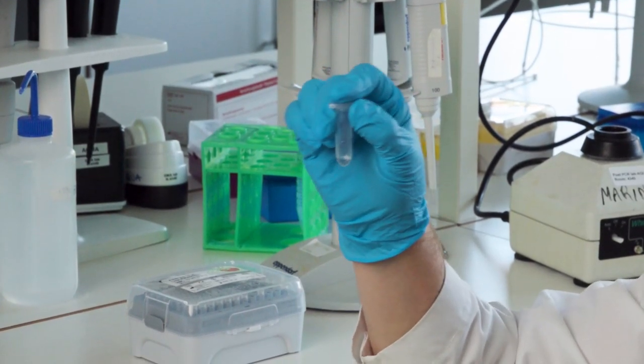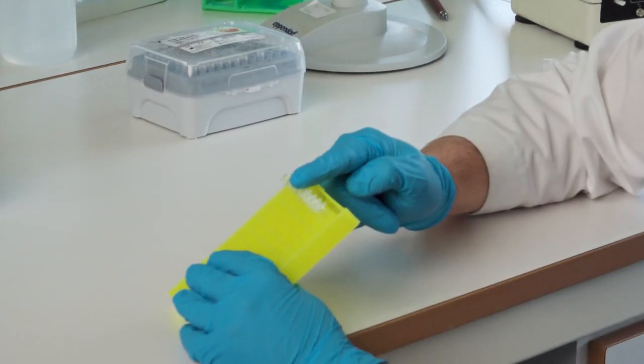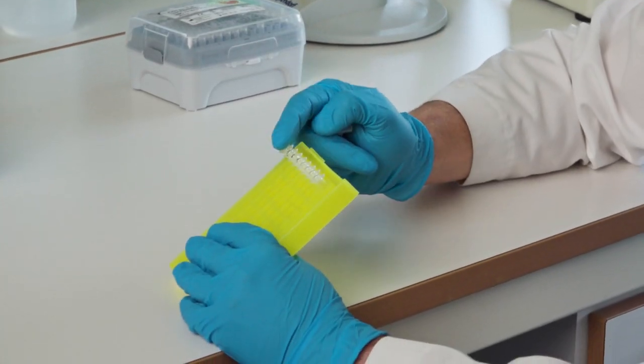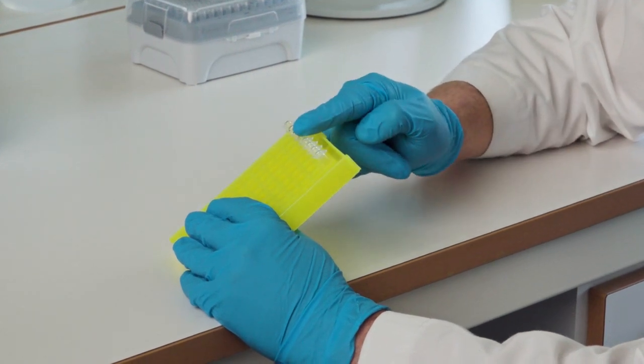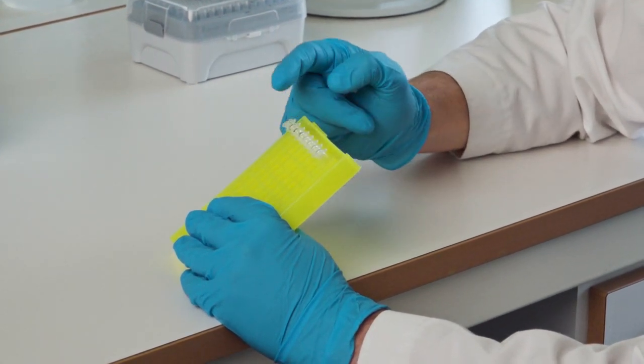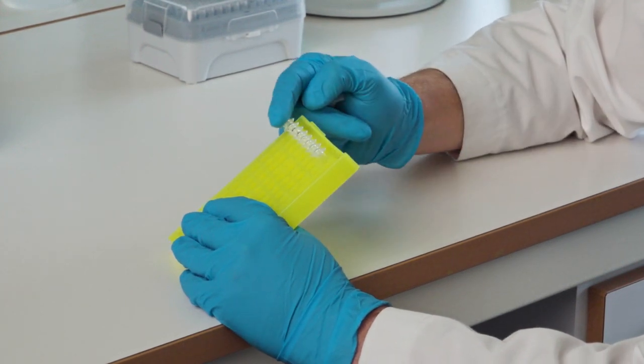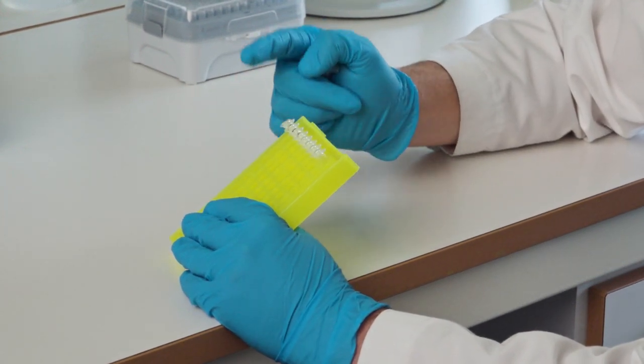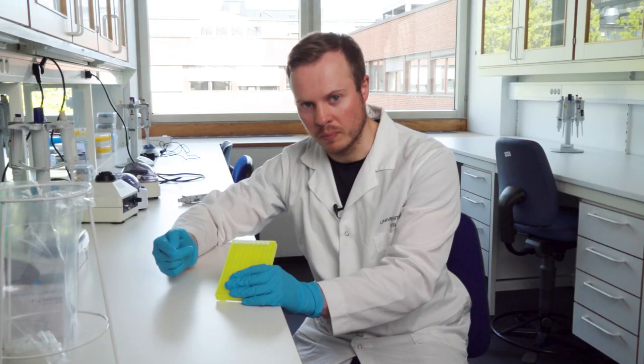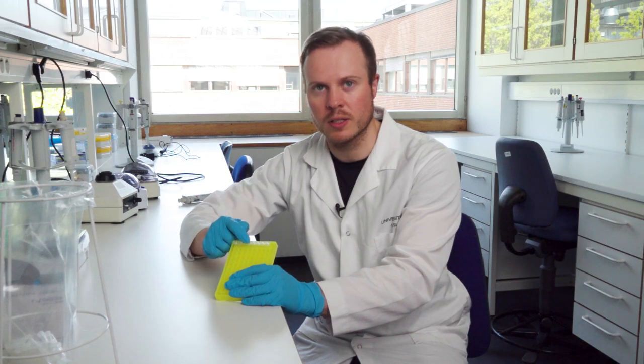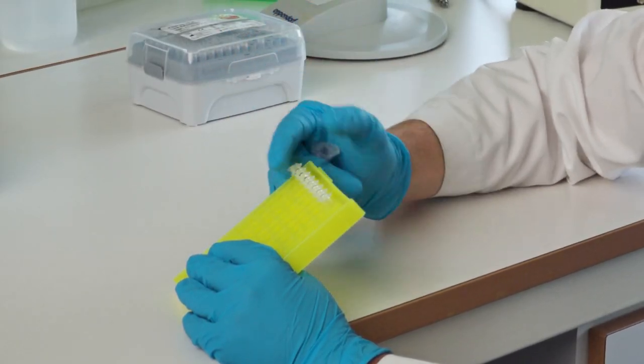This translates that we need to have the same amount of DNA from each sample. So say that we want to take out 40 nanograms of DNA from sample 1, sample 2, sample 3, and sample 4—from each of them. These samples will have different concentrations, so to get 40 nanograms from this tube, I need to take out a given volume—the same for this and the same for this and the same for this—to mix it in these equimolar concentrations.